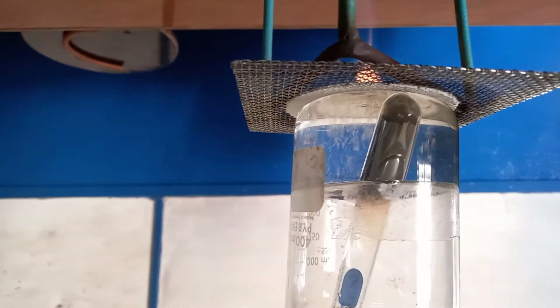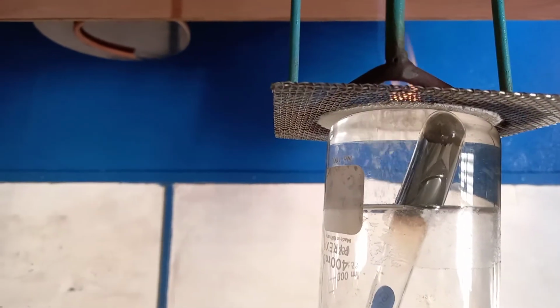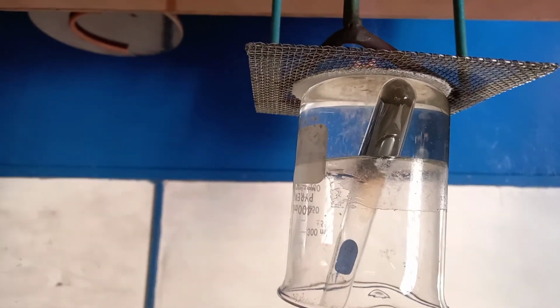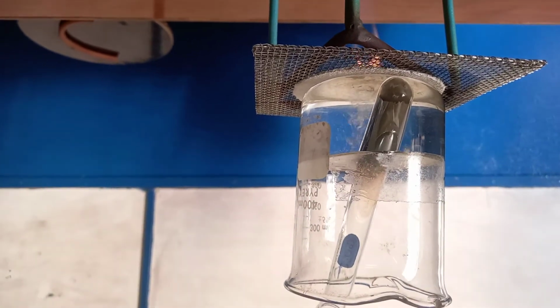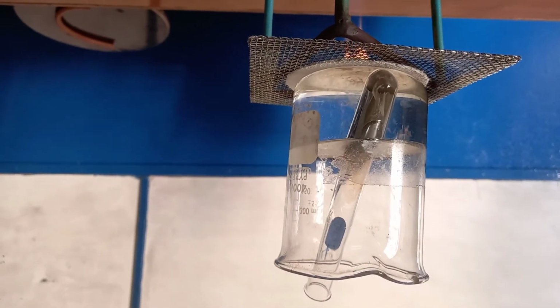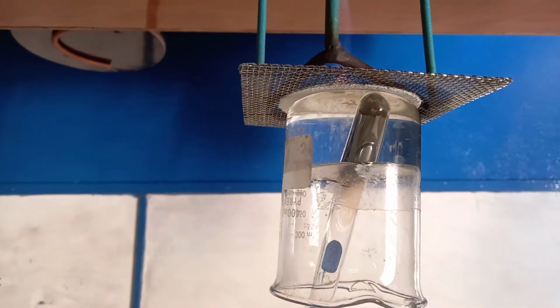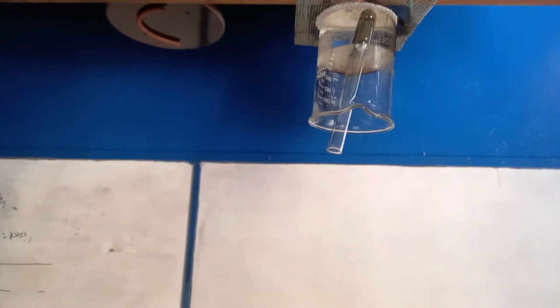Alright, so there is our silver mirror forming on the test tube. So that is a positive test for our product. So we know indeed that the ethanol was oxidized to ethanal. That's our silver mirror test with our Tollens reagent, which is a solution of silver nitrate and ammonium hydroxide. So time for the next one now.